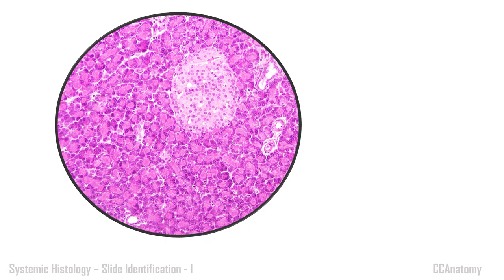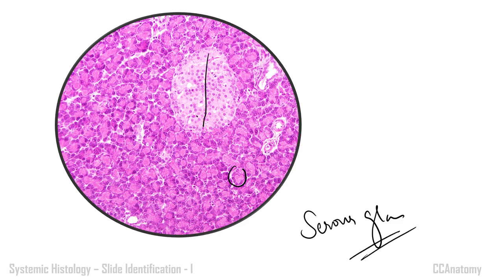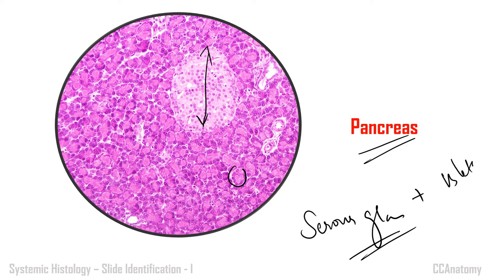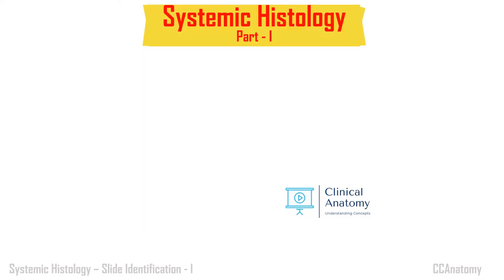If you've seen the first two videos, you can identify this as a serous gland. But in between, there is a different region — the islets of Langerhans — a group of cells located within the ocean of serous gland tissue. So this is the slide of pancreas: you have both the serous gland (exocrine portion) with groups of islets of Langerhans (endocrine portion).